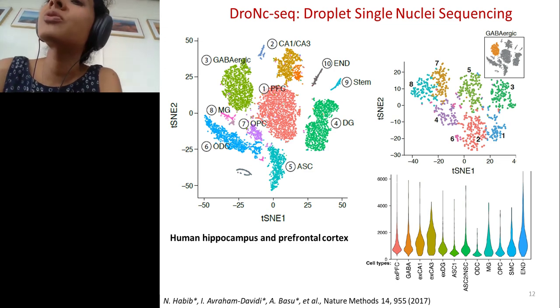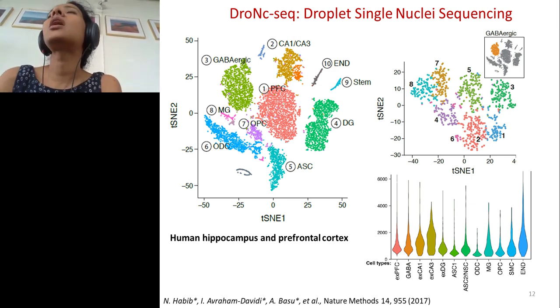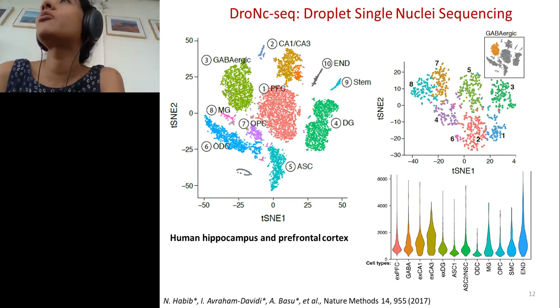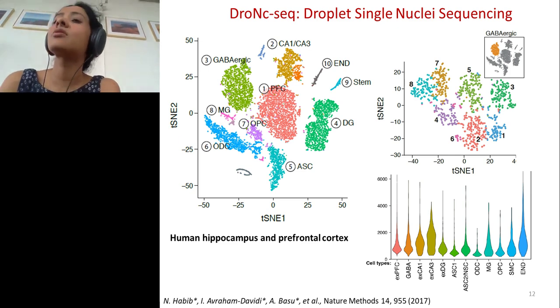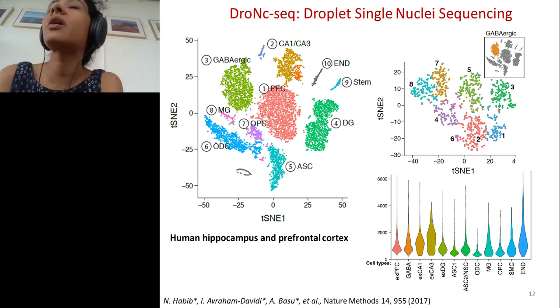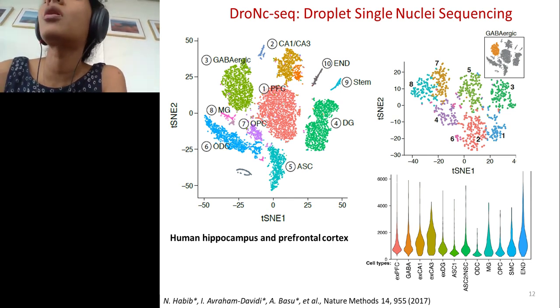And I should also point out that this tissue was obtained from the GTEx project, and it was archival tissue also. So not only for adult brain tissue, but this was good for frozen samples that were sitting for about 5-6 years in the freezer before we ran this. So the cell quality was pretty compromised to start with, and we were still able to make it work, which was very gratifying, and opened up our options for looking at many difficult to work with tissues.